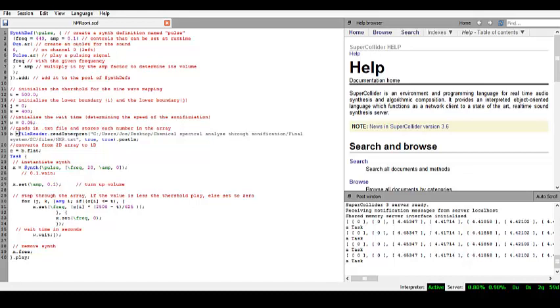And then here is where we're reading in our file using the file reader read interpret function. Now that takes the file and it'll translate its numbers and read it into an array. As we can see in the messaging system here, it actually reads it in as a two-dimensional array with only one dimension. So we then use the flat command to convert that into a 1D array. And we have our NMR spectrum saved into the program.